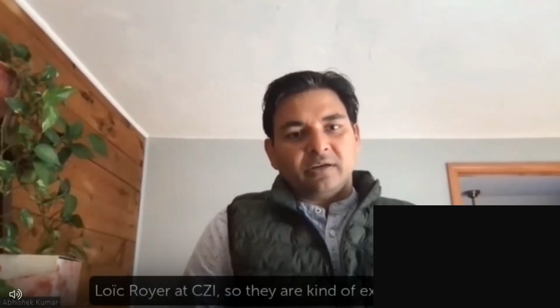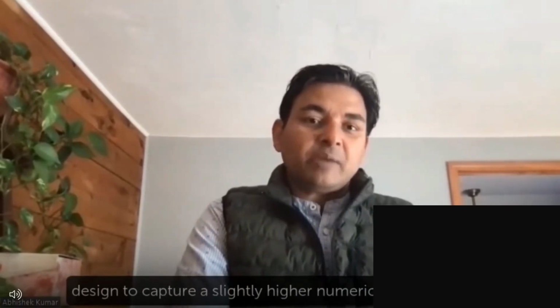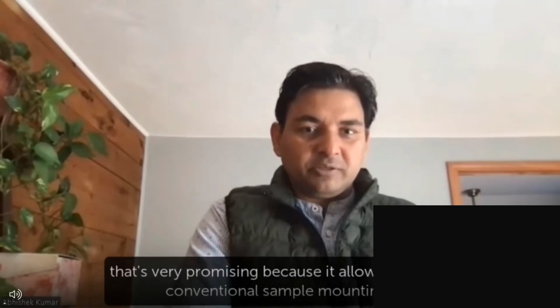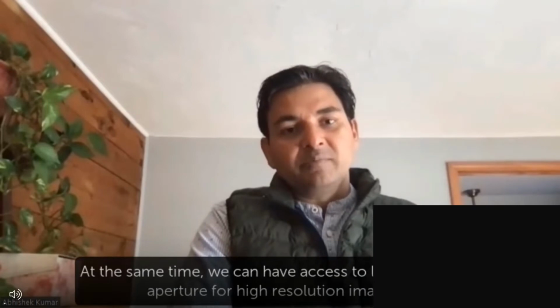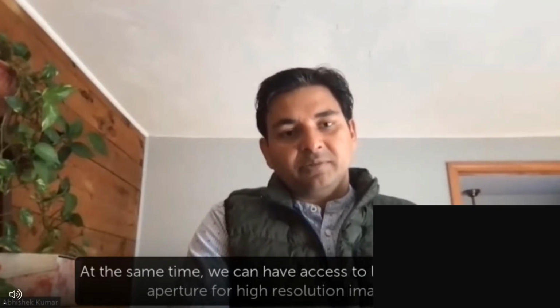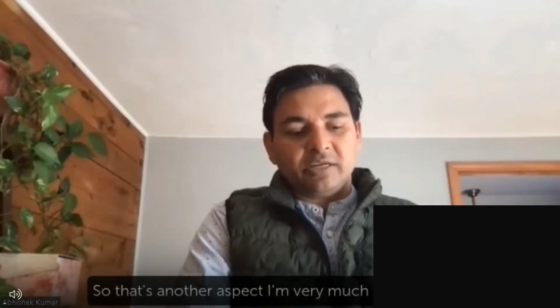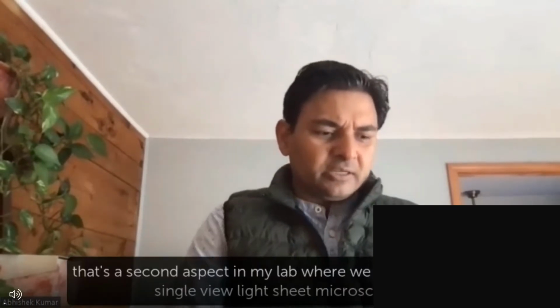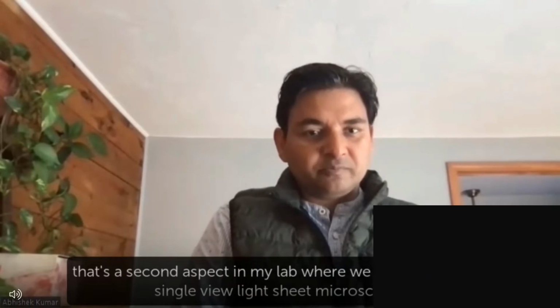So they have expanded this design to capture slightly higher numerical aperture. And that's very promising because it allows us to use the conventional sample mounting. At the same time, we can have access to large numerical aperture for high resolution imaging. So that's another aspect I'm very much interested in. That's a second aspect in my lab where we are interested in single view light sheet microscopy.